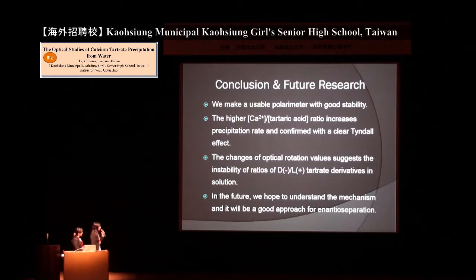At first, we confirmed the precipitate by a clear Tyndall effect. Then, we made a polarimeter which is usable and stable. Next, we discovered that the change of optical rotation suggests the instability of the ratio of D-form and L-form tartrate in the solution.